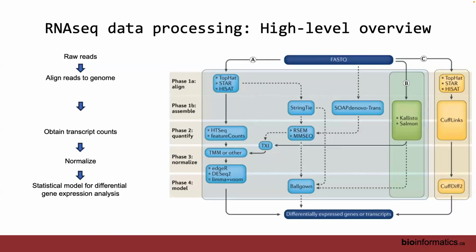You wouldn't do that in this particular case, because the source of the bias is different. So if you are looking at a PCR amplification bias, then you have to have somewhere in your downstream model, when you're fitting the quantities of the gene, something like %GC in the model, if the field agrees it's big enough a problem that you would expect that. But normally, this pipeline doesn't show it in detail, but after assembly, usually sequencing pipelines have a PCR deduplication step. They remove duplicate molecules, okay?